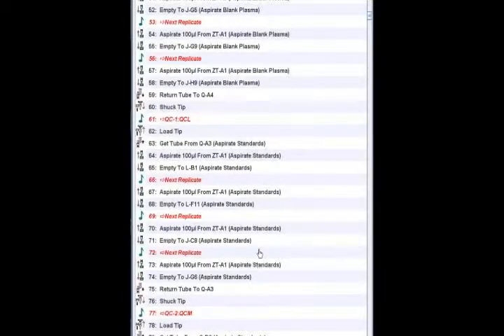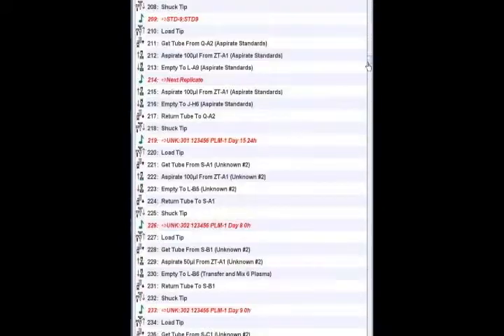Returning to the program steps, the next sequence of samples are the standards. Notice the same block format of replicates. Step 219 begins processing of unknowns. Notice the location of each sample tube is defined. For example, SA1 and its corresponding destination LB5. This program is running by position. The operator must place each sample vial in its defined position.